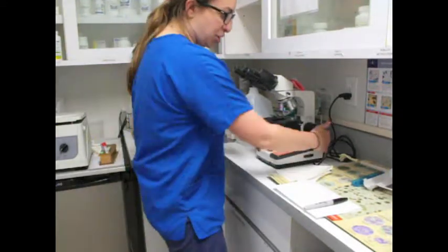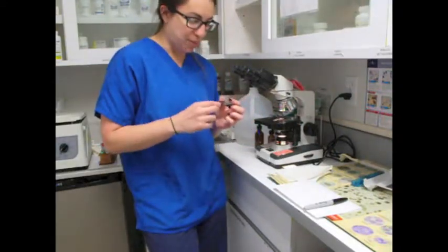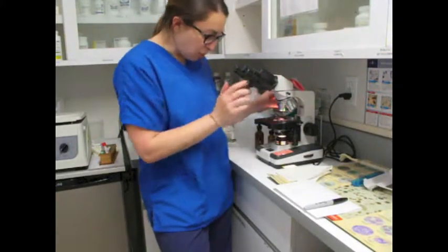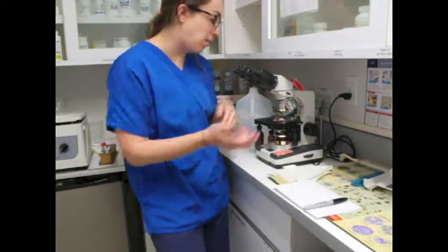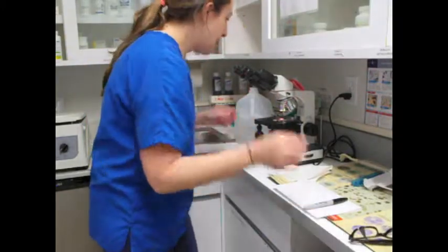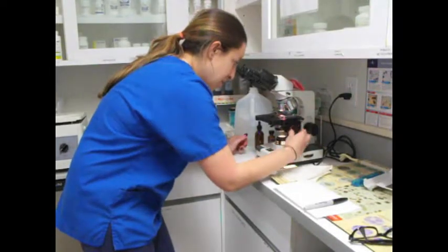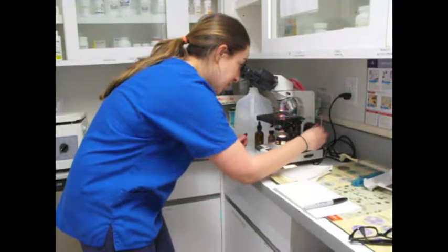So first you want to turn on your microscope. You want to face the slide on the microscope stand with the butt end towards the left side. So I'm going to do that. So first what you want to do is put it on 10-time power, the low power. Just going to take the glasses off. And you just want to do a general scan. You want to focus. You want to properly focus the microscope, make sure the lighting's okay.